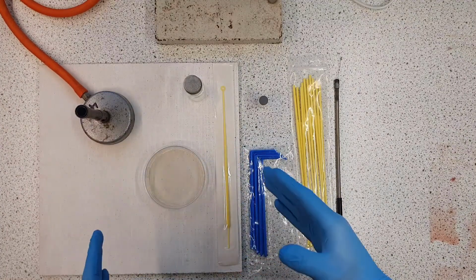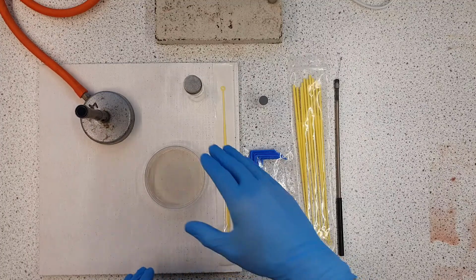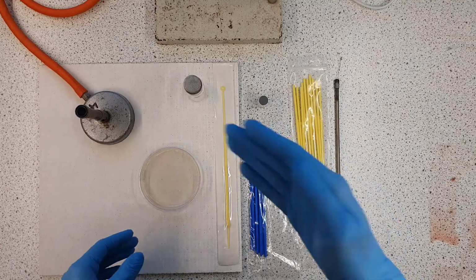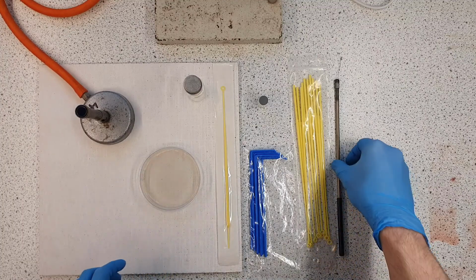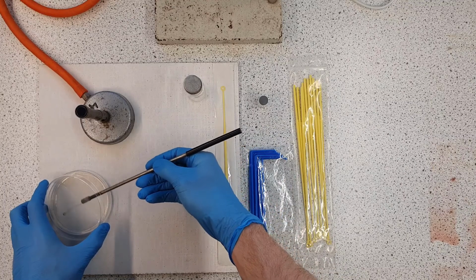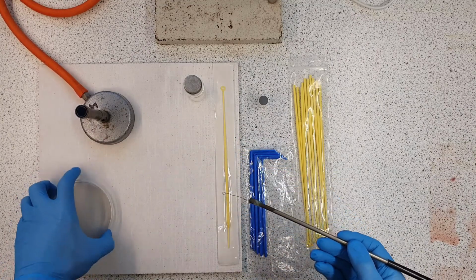Whenever we are opening petri dishes to inoculate or spread, or to interfere with the media in any way, we are going to open it towards the flame like that. So you're just tilting it away from the flame, which prevents the majority of bacteria from landing on and contaminating the dish. And we're also going to be exposing it for as little time as possible. So if I just move this a bit further away so I can operate properly, open it like that, and then we're going to be doing whatever we need to do at this distance, opening it as minimally as possible, and then closing it.